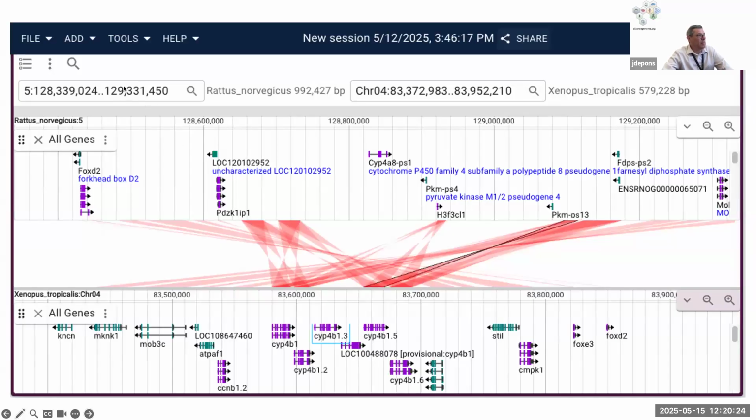I've got an input box for the position up at the top, which I can add genes in there. So if I wanted to set a gene here or gene here, I can do that. I can drag and drop these tracks to move them left to right, and all my lines are going to stay connected and kind of flow. Here's an example of the track selector. If I wanted to add tracks, that's where this gets really powerful, adding additional tracks for variance or expression or whatever it is that you're looking at. Here's my track selector button up at the top, which is that menu with the 3 circles on the left of it. So if I select that, I could add tracks to either side of this.